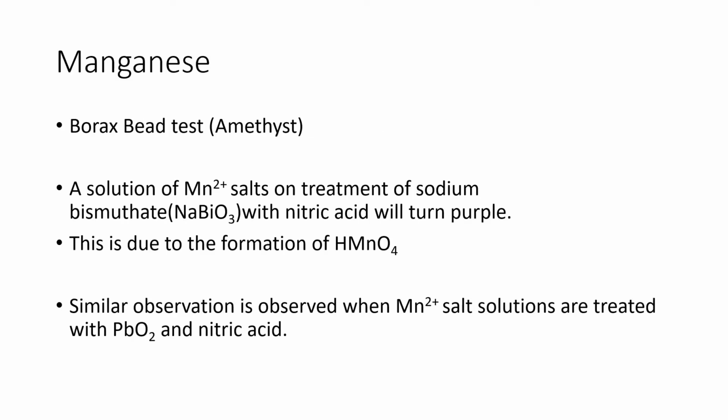Let's talk about the second metal, manganese. If the borax bead test is performed with a manganese salt, an amethyst colored borax bead is obtained.